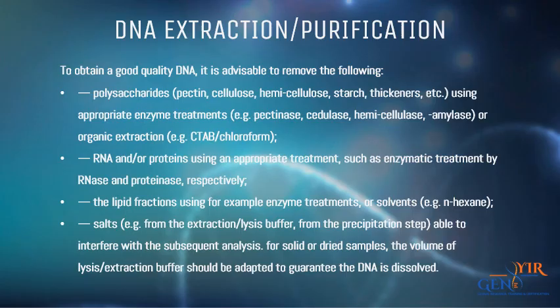DNA extraction and purification. To obtain a good quality DNA, it is advisable to remove the polysaccharides, RNA, proteins, lipid fractions and salts.